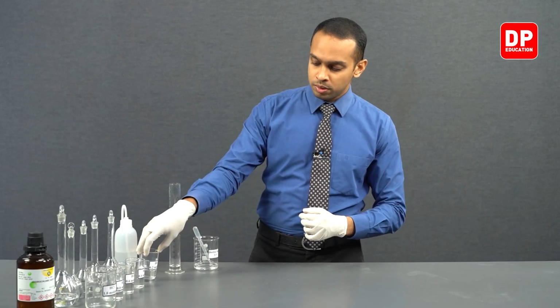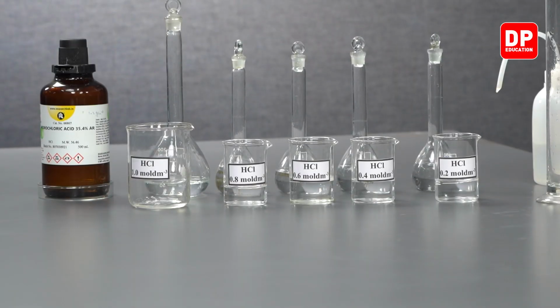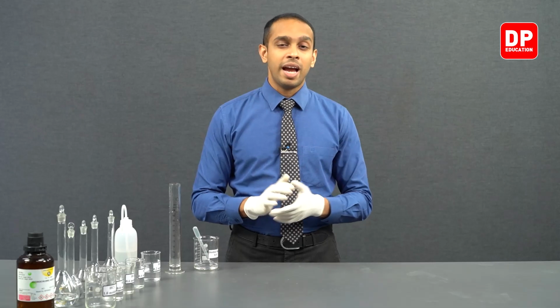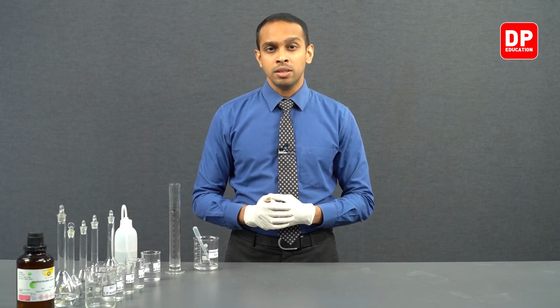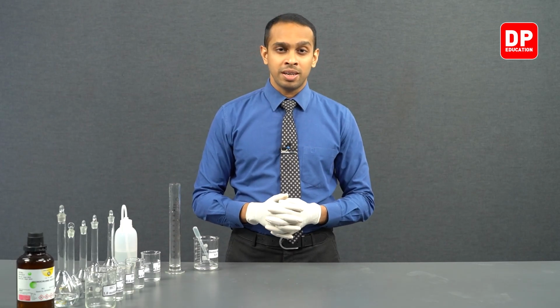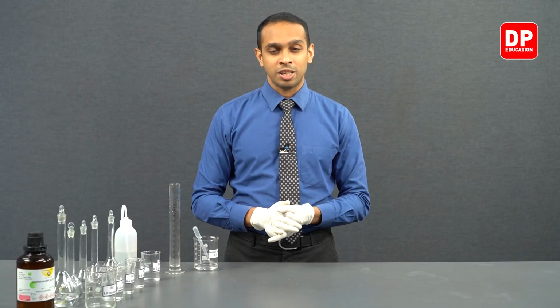Now we have prepared all 5 different HCl solutions that we need for this experiment, and finally find out the order of the reaction with the use of the data we collect throughout this experiment. Let's move on to the next part.